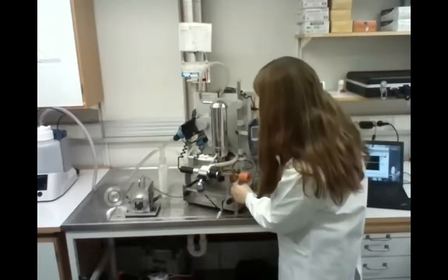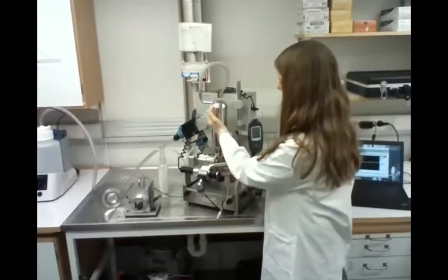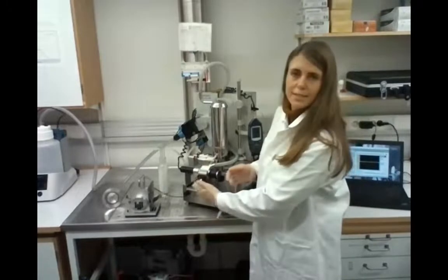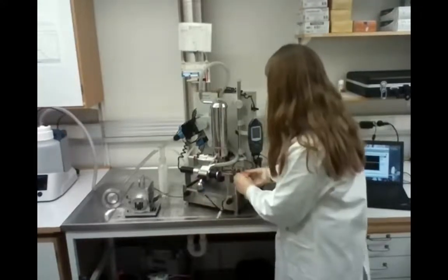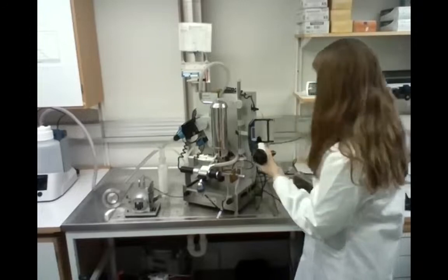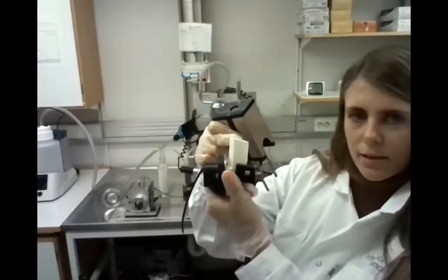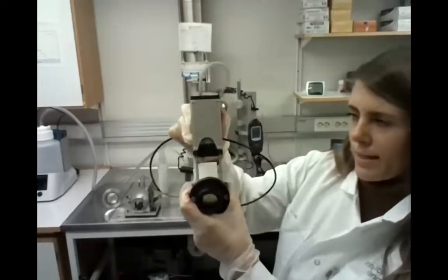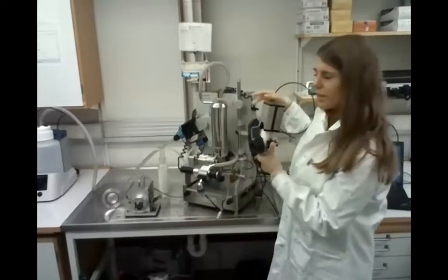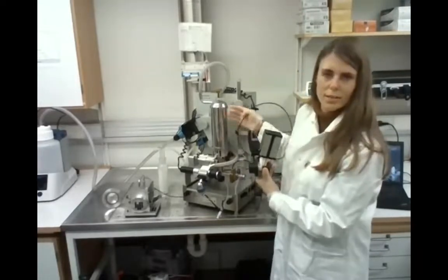So what's happening in the system is that we pull aerosol up in the chamber, and then we put on our exposure flow, and we will pull this aerosol out down to the filter, the end filter. And another option is to use a PMDI. And this is the PMDI trigger. You put your PMDI here, and this has an automatic trigger function, which will be synchronized within the PreciseInhale, and you will trigger the PMDI, and it will be pushed out and dragged out in this holding chamber.